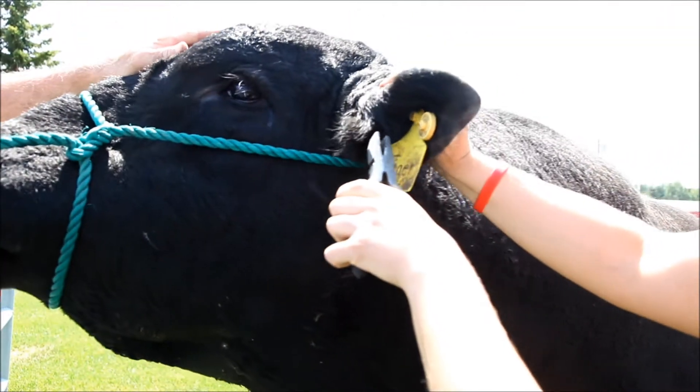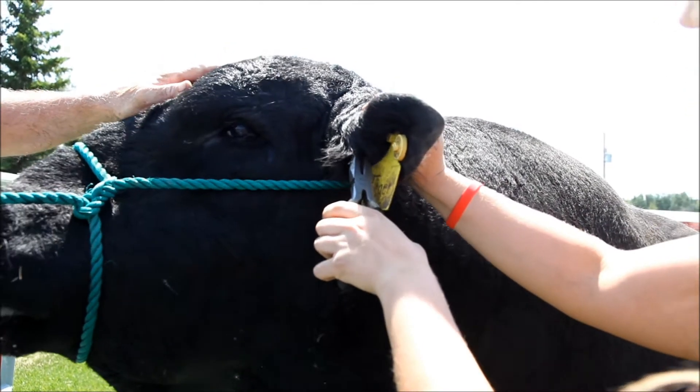If the tail is not an option for pulling hair, you can also pull hair from the ear of the animal.